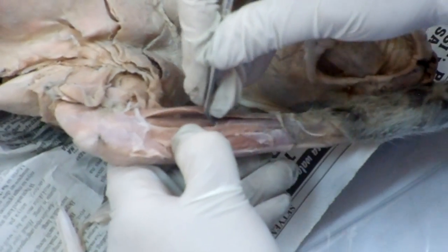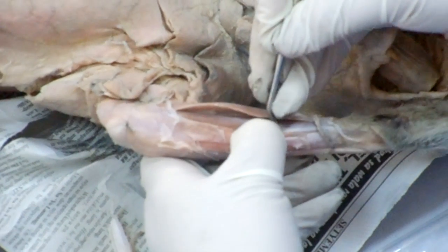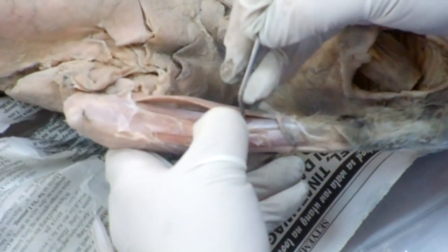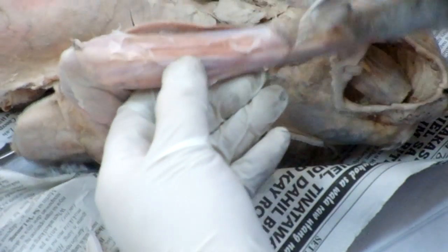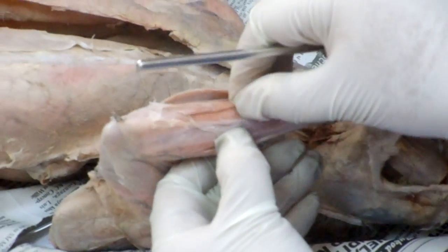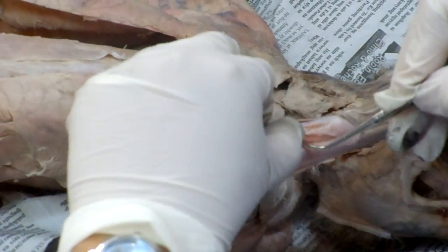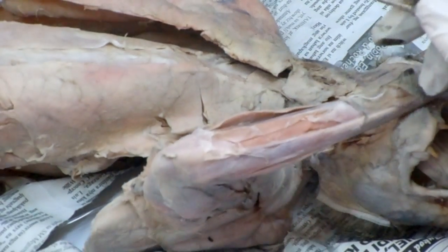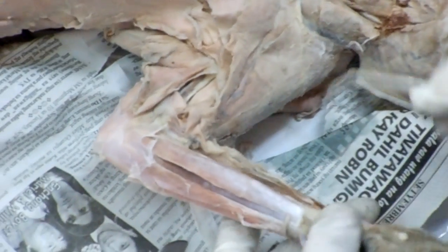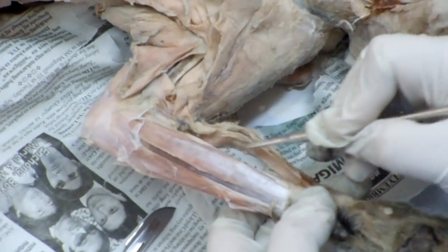Origin: first head, medial epicondyle of the humerus, in common with one of the heads of the flexor profundus digitorum. Second head, olecranon process of ulna. Insertion: both heads by a tendon on the pisiform bone of the wrist. Okay, ulit nga. From here. Mga ito.